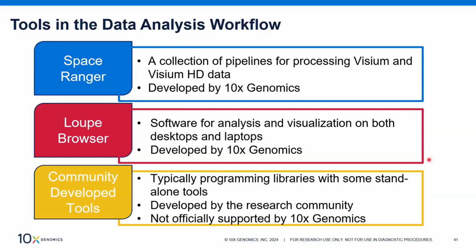For the Loupe Browser, this is a software we have developed for the analysis and visualization. You can use it on your desktop or laptop computers. You don't need the same kind of calculating power as you need for Space Ranger.